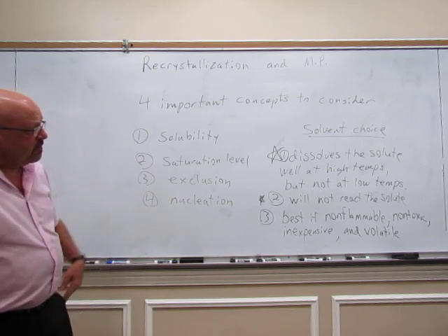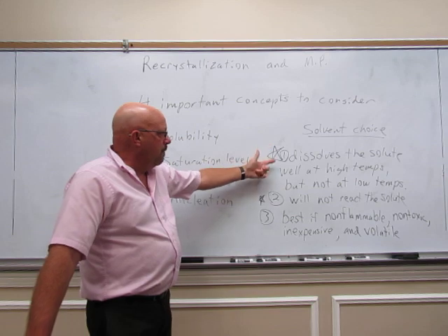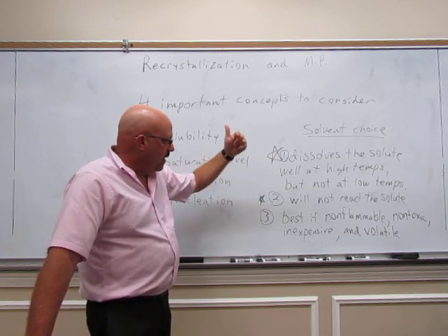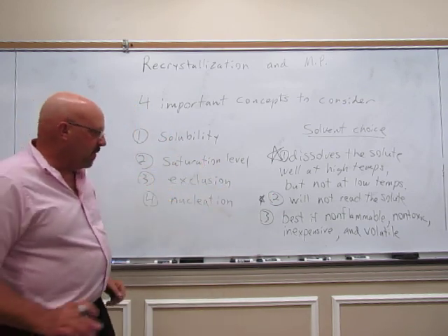So, those are some criteria to consider when we choose a solvent. First two are absolute requirements. It must dissolve the solute well at high temperatures, not at low temperatures. And we must have a solvent that will not react with the solid. The rest are just nice to have, but not a requirement.